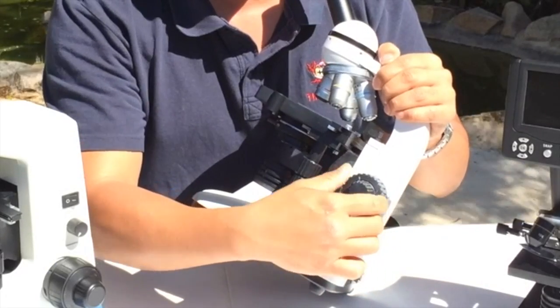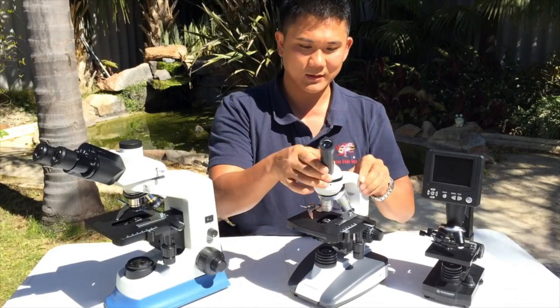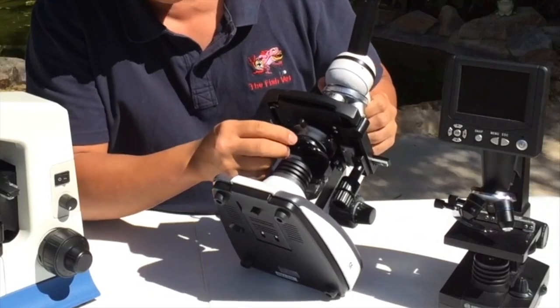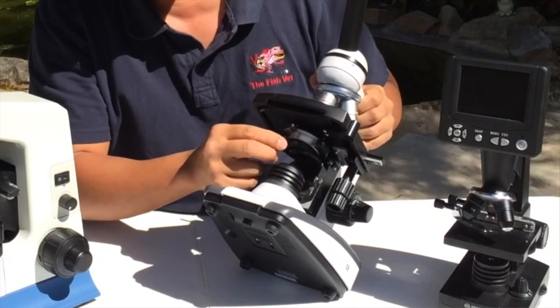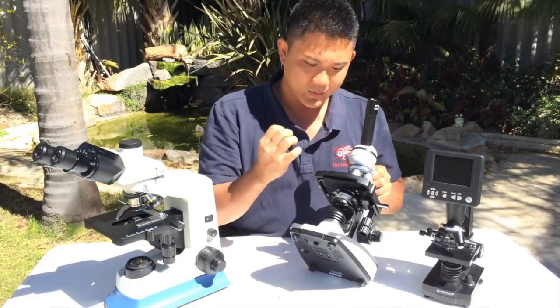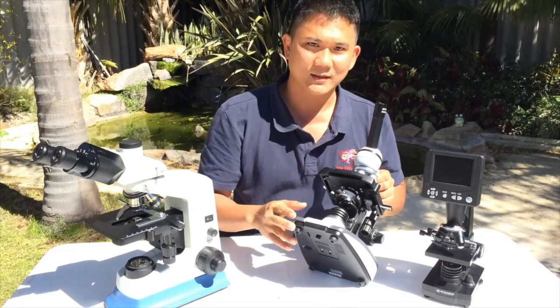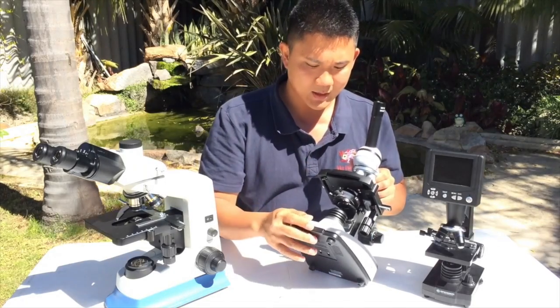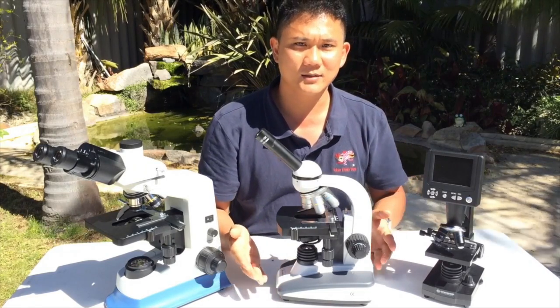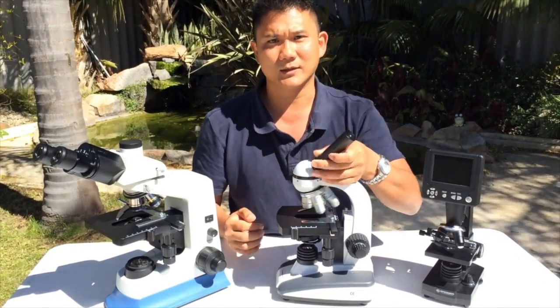Other features include an iris diaphragm and a condenser, which help you visualize things in 3D or for flat-type samples. A microscope like this would probably set you back around five hundred to one thousand US dollars, and it's very good for field work.